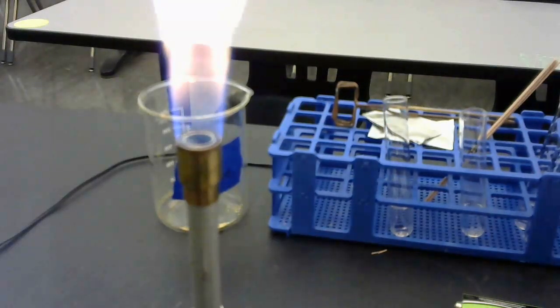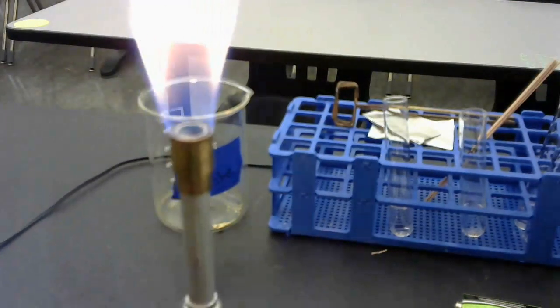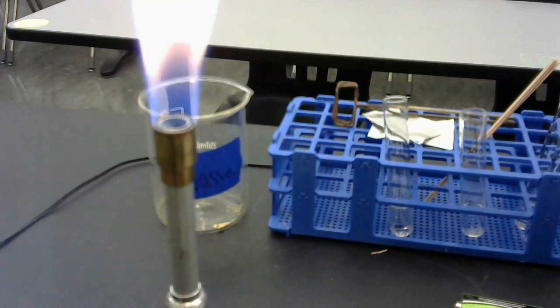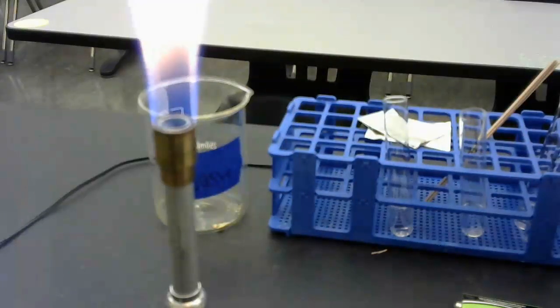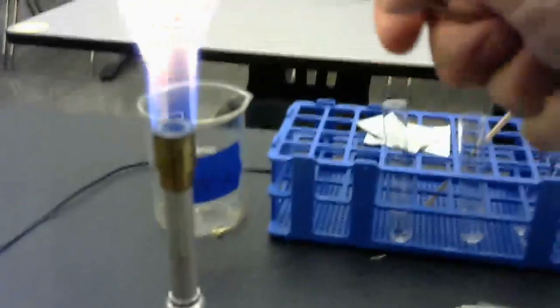My mass right there is 9.74. So I'm going to record that on my lab, 9.74 grams. And then I'm going to take my test tube tongs, grab my test tube, and heat it. Remember, we want to heat at the surface.